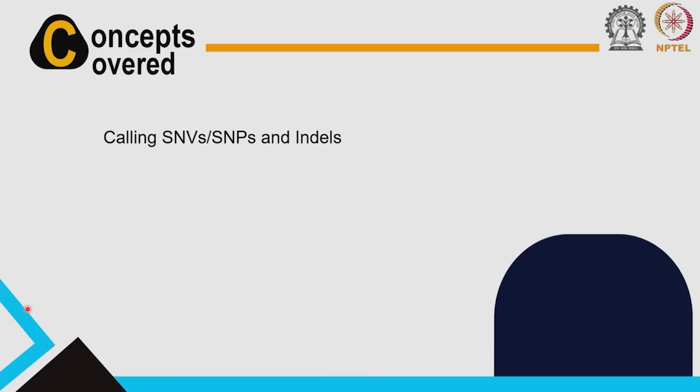In the last class we introduced different variants, especially SNPs and SNVs, and in this class we will talk about how we call these SNPs and SNVs and the small indels. We will talk about the steps, and in the hands-on later on we will actually do these steps one by one, so you will learn how to do them yourselves with real data sets. This is what we will be covering today.